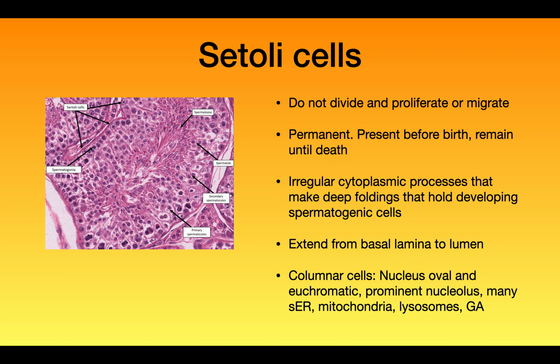And they have very interesting cytoplasmic processes, and they make these deep invaginations, and those will hold your spermatogenic cells or your germ cells.